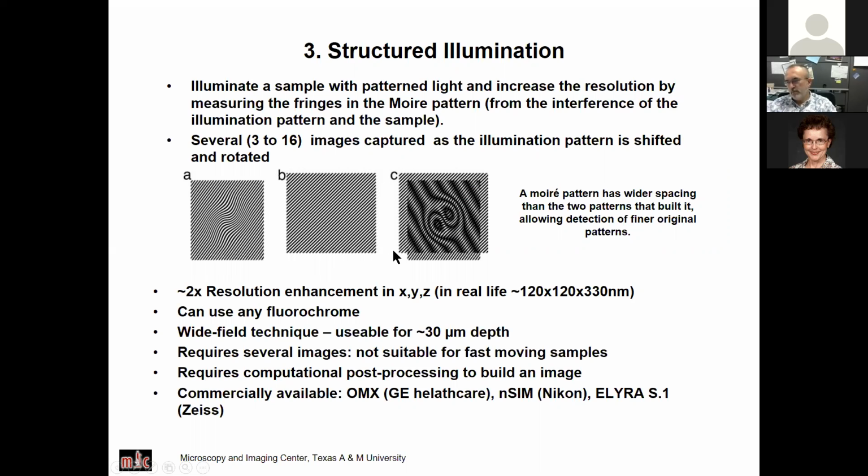Depending how you set your parameters, you can get either a nice looking, less resolved image, or you can also get maybe a higher resolution image with some processing artifacts. So it's somewhat tricky to know exactly what you're getting.